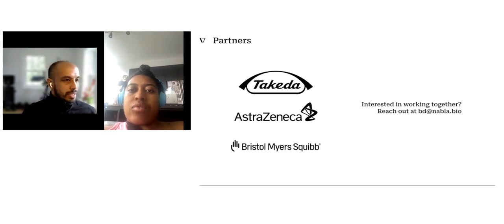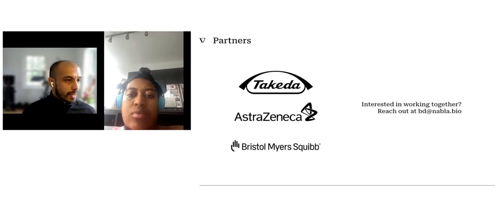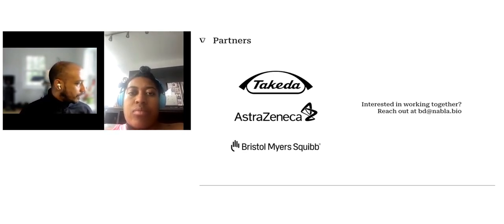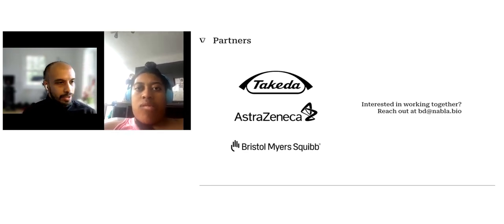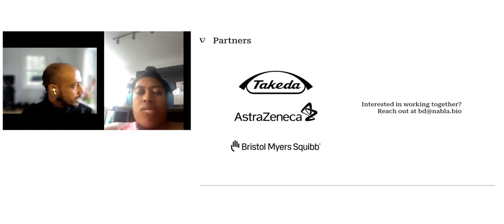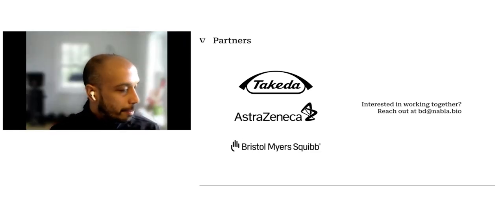So the library sizes for VHHs, typically we're doing something between 10,000 and 100,000 VHH designs. There's no real limit on that. At some point, you're just paying for a lot of DNA synthesis. And the throughput of yeast display is so high, we would never exhaust that throughput. But yeah, 10,000 to 100,000 designs is typically what we're doing.